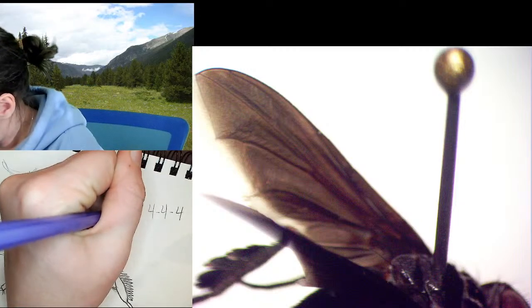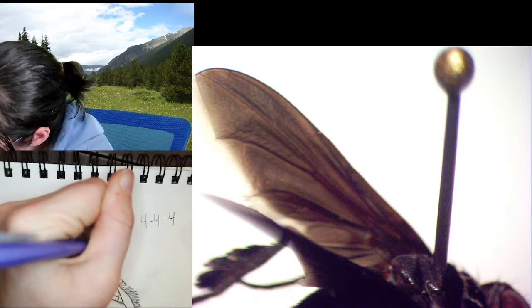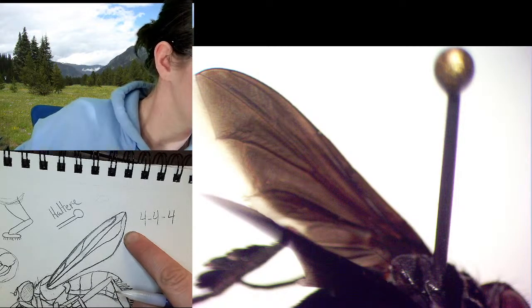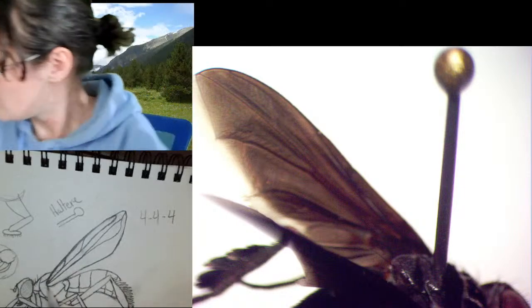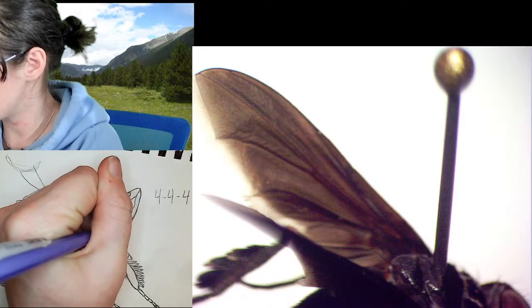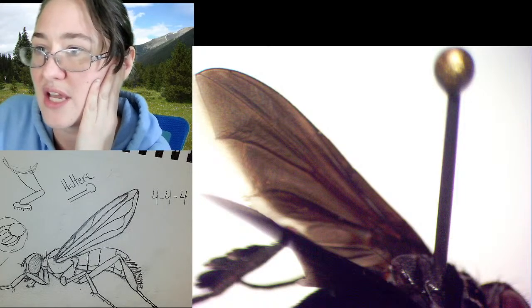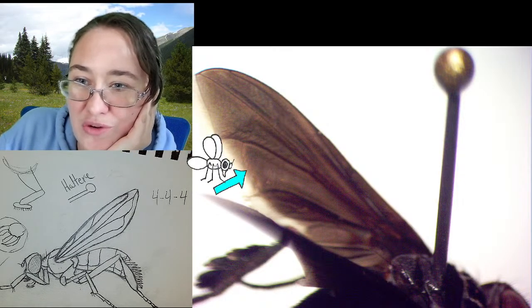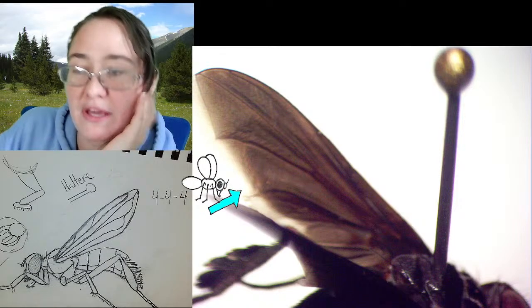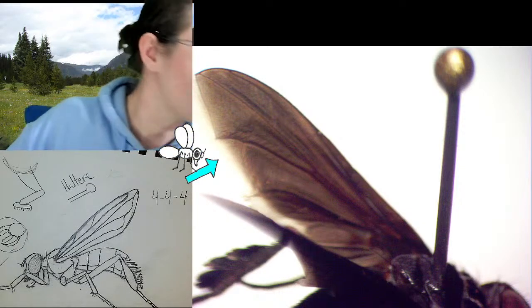What it does is there's a cell. It creates a cell, but never touches the end of the wing here. It also splits really low, comes up, creates another shape here, and there's this S-shaped vein. So these veins never touch the edge of this wing, and it's difficult to see under the microscope, but this white is not where the wing actually ends. There's a clear region of the wing past the dark color, but because the microscope is trying to take into consideration how dark the fly is, it's blurring out this white region of the wing.